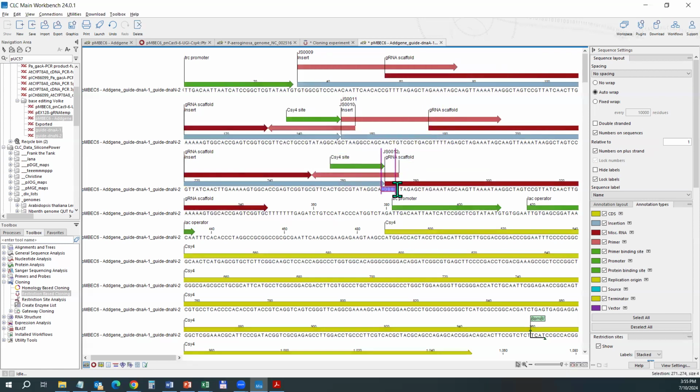Then in the plasmid, so this is rather a construction artifact, I guess, we have another gRNA scaffold, which is not important for anything. So basically, our two mature guide RNAs will correspond to something like this and something like this. And these will now direct Cas9, our base editor based on Cas9, to the respective positions to achieve base editing.